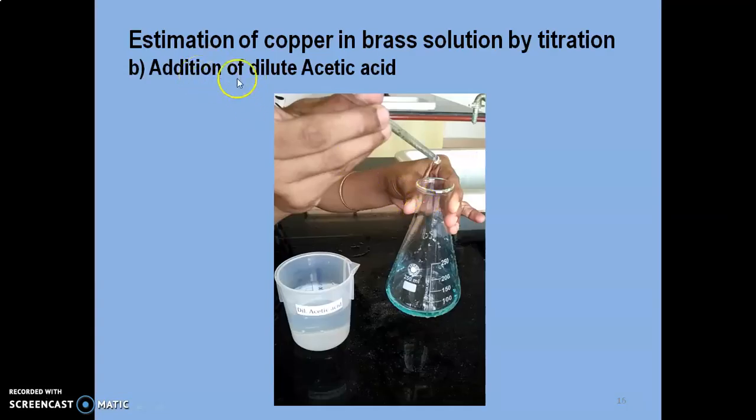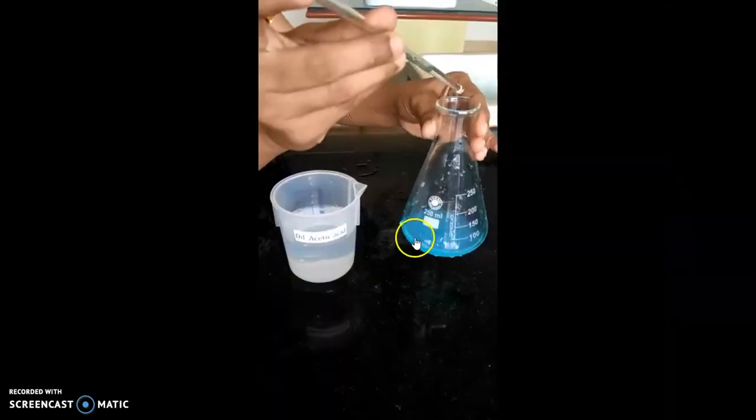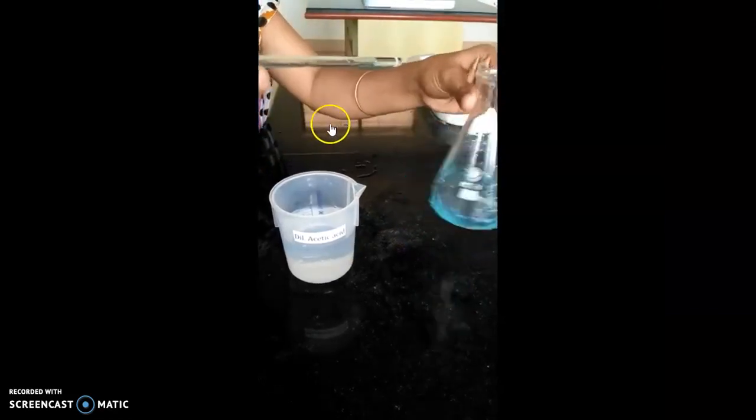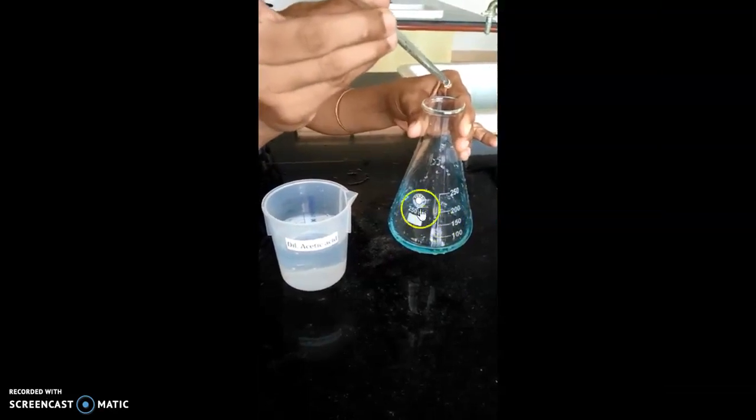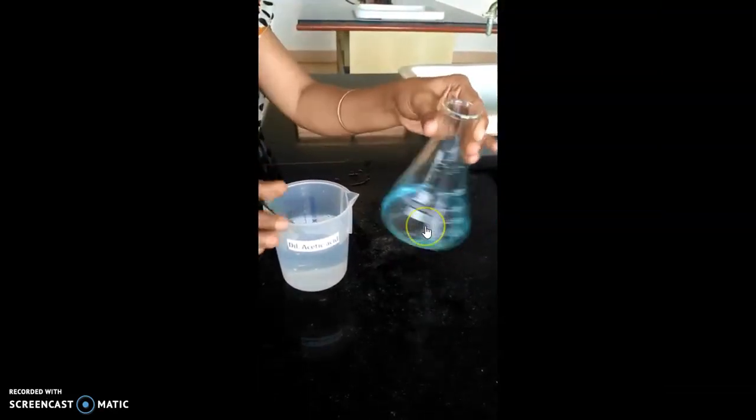Later, addition of dilute acetic acid is done until the precipitate dissolves to neutralize the excess ammonium hydroxide. Few drops of acetic acid are added carefully until the blue precipitate dissolves.